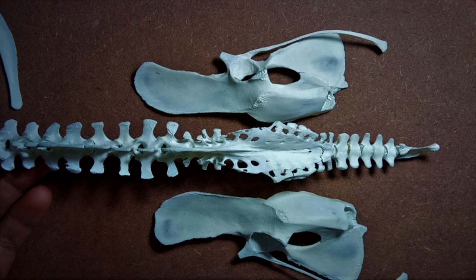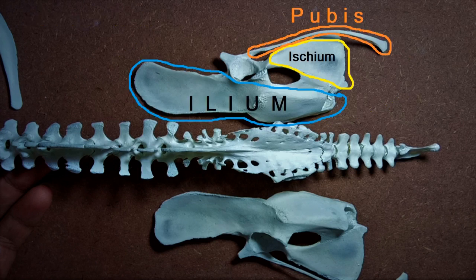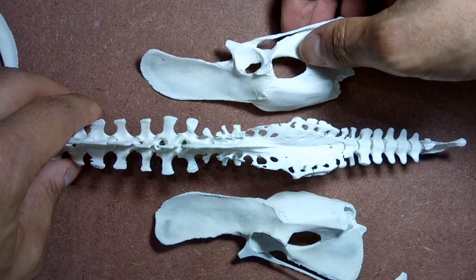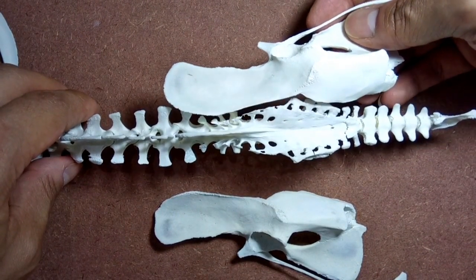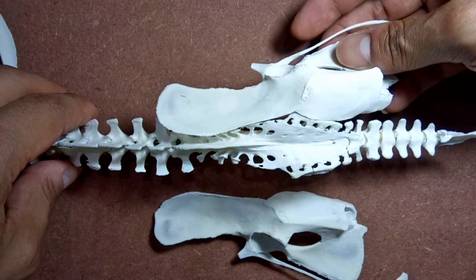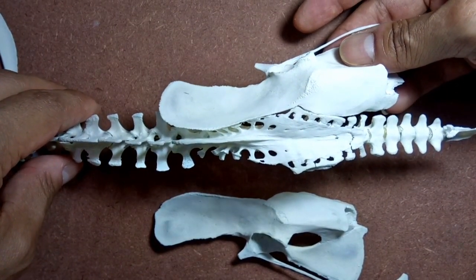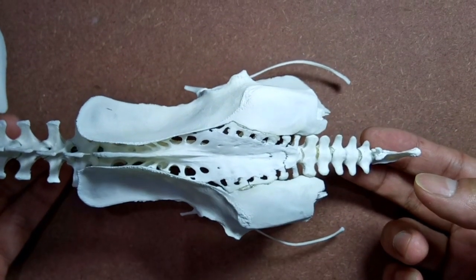As already explained in the first video on chicken skeleton, the pelvic girdle is made up of two separate halves lying on either side of the synsacrum. Each half is known as the os innominatum and is made up of three parts: the ileum, ischium, and pubis. At the junction of these three bones is a concavity known as the acetabulum, which is the articulation point for the femur. This clip shows how the pelvic girdle articulates with the synsacrum, and here is the articulated pelvic girdle.